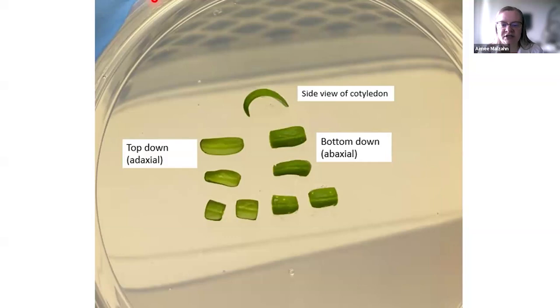So I'll read this question from Billy. Would you mind commenting on why the protocol uses a pH of 6 in the media when the large majority of tissue culture protocols use a pH of 5.8? Some of our medias are 5.8 and some are 6, but everything we found worked for plant material at 5.8 to 6.